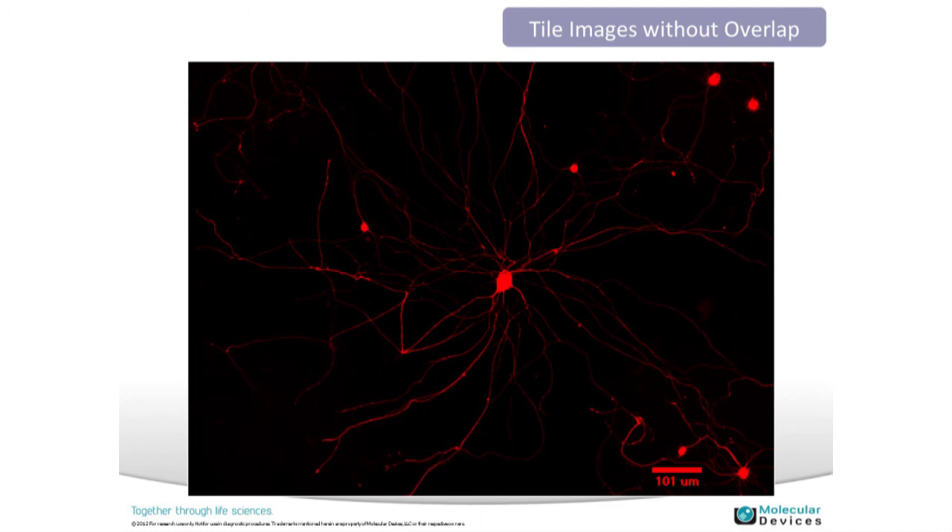Stage precision is very helpful for objects and structures that extend beyond a single field of view — for example, cells with processes or tissue slices. The stage precision allows us to tile sites together without needing to acquire with an overlap, which is typically required for stitching larger structures. This reduces software processing time. With zero spacing or zero overlap, we're still able to connect these processes together.